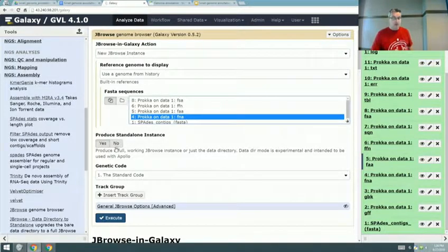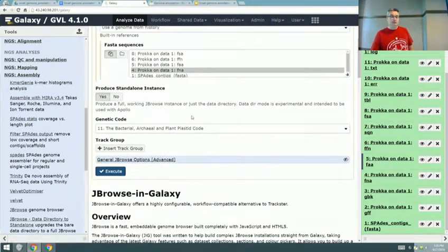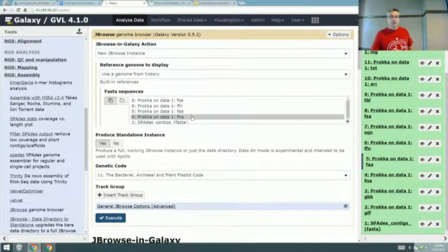Are you doing JBrowse? Did anyone get to the JBrowse part of the tutorial? Oh, cool, awesome. I had problems. One thing is it's a slightly different version. I could not find the wild type or how to add it. It's in a different history, in the track data. It's not on the second server.